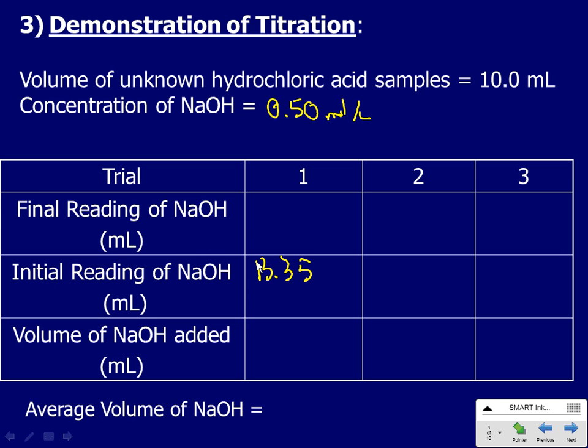So now I got to measure this. I got to turn a little bit here. I'm going to take my white paper, put it in behind, and I've got 22 point, and it's right on the mark. So it's 22.90.